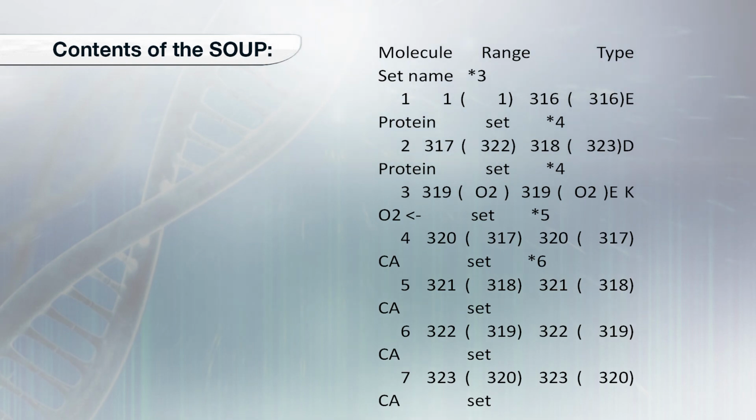A short description of this molecule, the set name, will be represented and will be given as the name the user has given. This set name is only relevant when WHAT IF is used interactively. Some notes regarding the PDB file will also be represented.